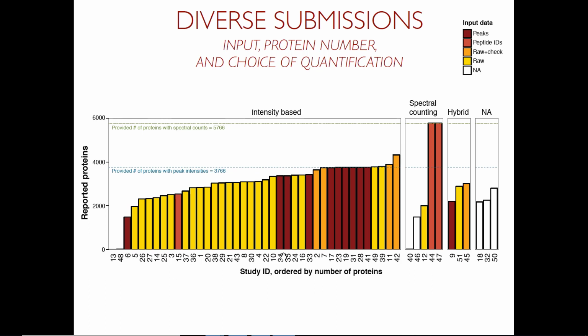Here the x-axis is the ID of the study. Different panels separate submissions which were using MS1 quantification, and quantification by counting MS-MS spectra. This is some kind of hybrid approaches which used both, and these people didn't document what they did.